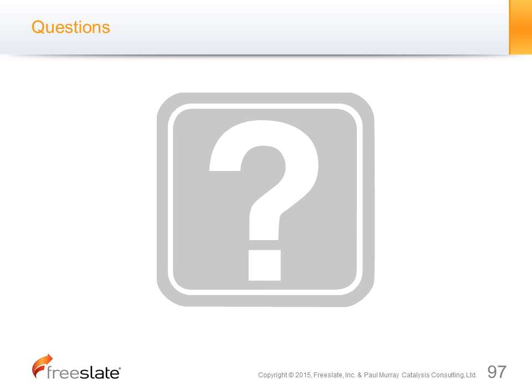First question here, Dr. Murray. Can you just cover again, what does resolution mean in factorial designs? That's a great question. If we remember at the beginning, when we talk about the experiments, we look at the number of factors that we think are important, and we think of the ranges of those factors. Based on that, it would suggest a large number of experiments that you have to carry out. So the resolution is something that comes in when we run a fractional factorial design.